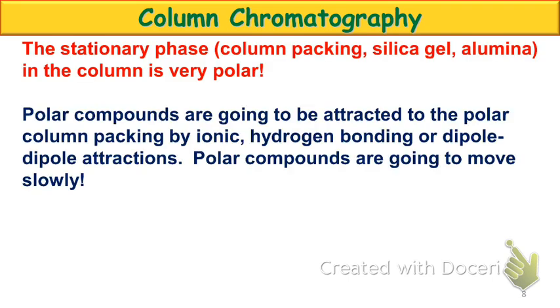Talked about our stationary phase. What about our compounds? Okay, so again, if we looked at TLC, pinky and thumb. Okay, thumb being up top for those of you listening on the slides that can't see my hand. Our thumb's up high and our pinky's down low. Which compound is the most polar in TLC? The pinky, the bottom one, because it's stuck. It's not traveling. If we now move to column chromatography and we turn it upside down, which compound comes off last?